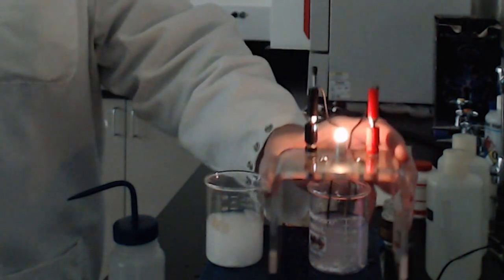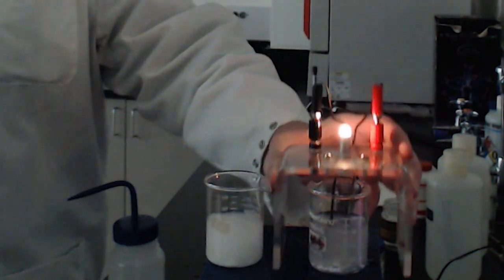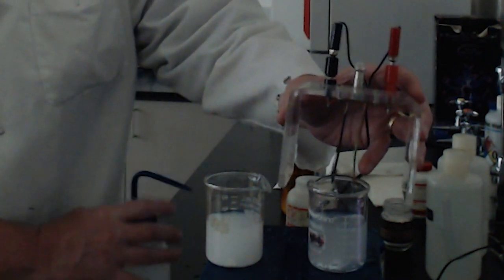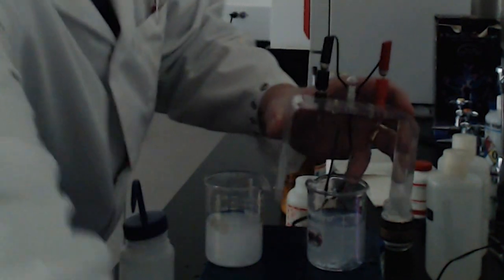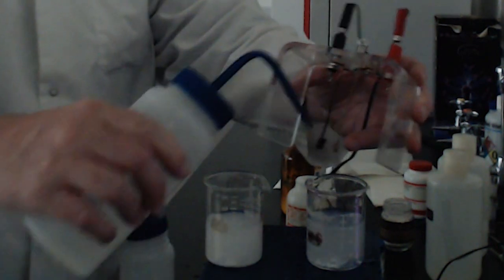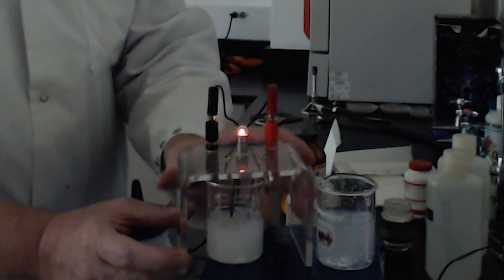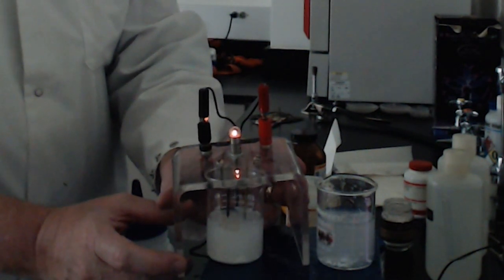So the one on the left here, or your right, is the magnesium sulfate, and you see the light bulb shines nice and brightly. I'm going to rinse off the electrode now. And we'll place the calcium sulfate in it, and you'll see that it barely glows.